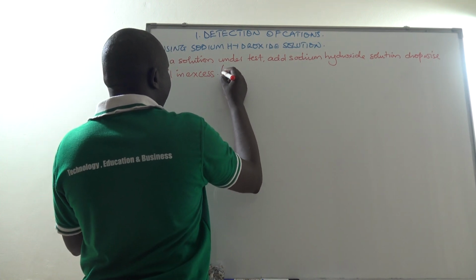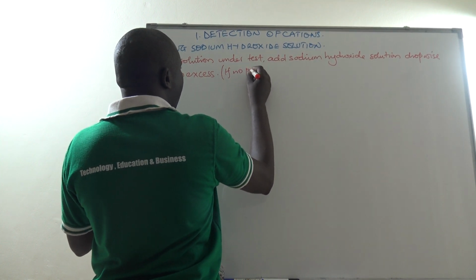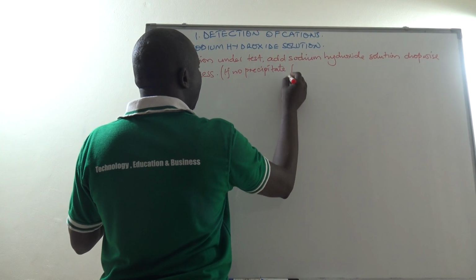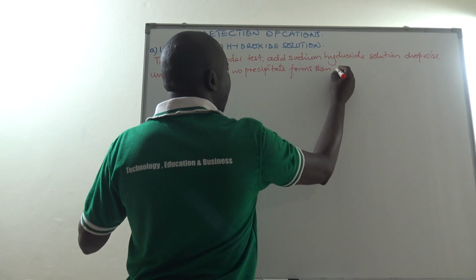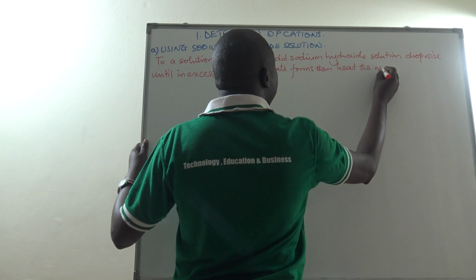So let me just add it here that if no precipitate forms, then heat the mixture.